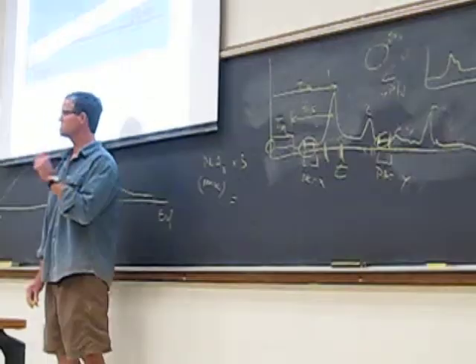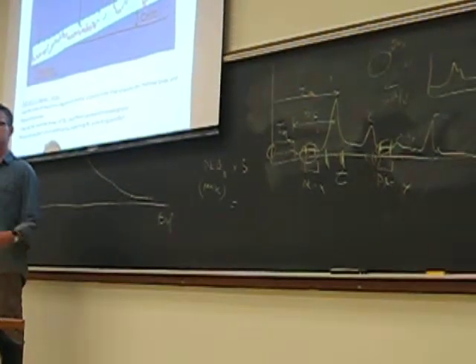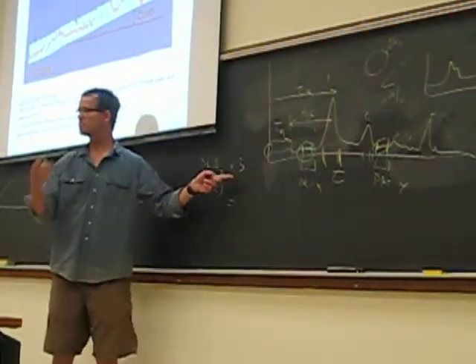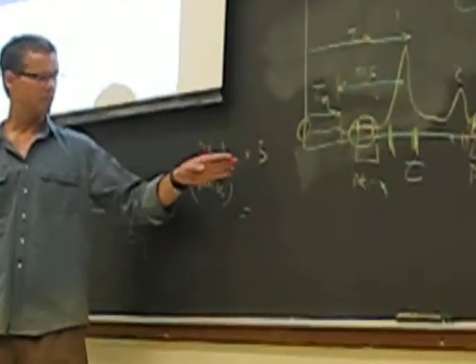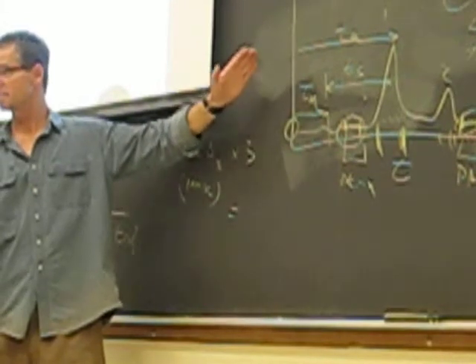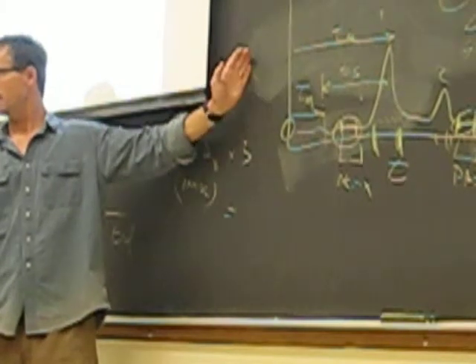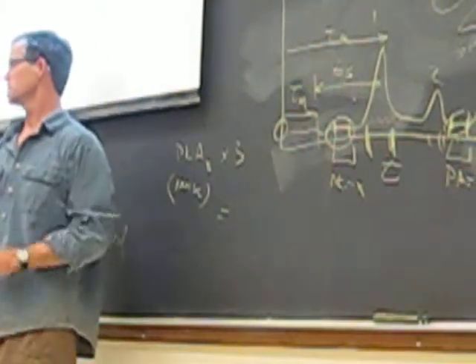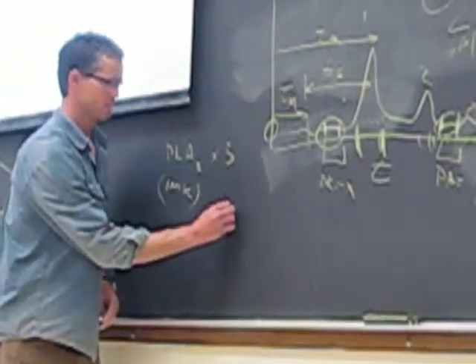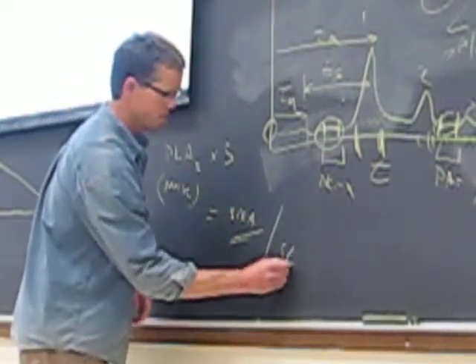Because what units is the detection limit in? It's not in peak area, that means nothing, right? It's in milligrams per liter, or whatever the units are for the analyte, right? So you would take this peak area, just like you did for lab 1, and convert it from the units of your detector response, in this case microsiemens times minutes, into a concentration, because that's what matters to us. Right? And to do that, you would simply take that number, so now it's 3 times the noise peak area, and you then divide by the slope.